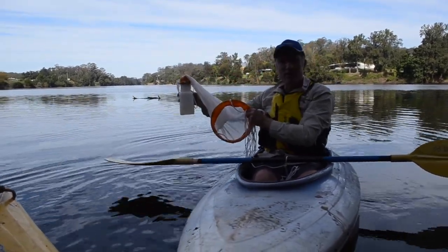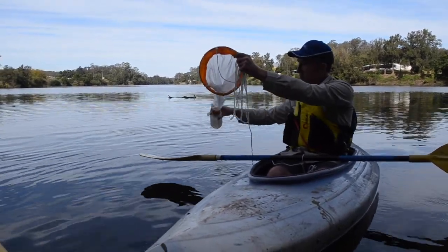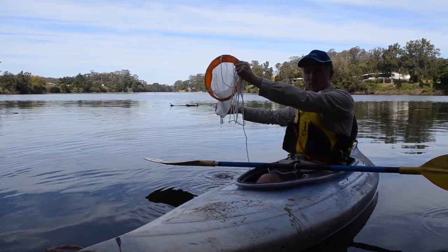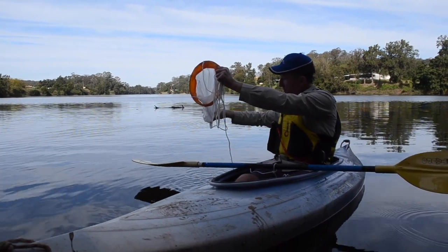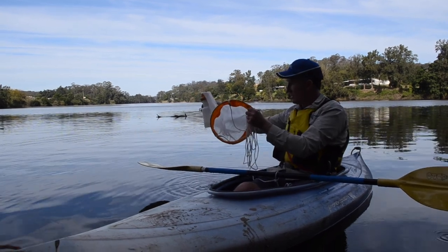Now we'll do that ten times. As the bottle gets full, you can concentrate the sample by just tipping some of the water through the net and putting it back in the bottle. It's a way of keeping the algae but tipping out the water and concentrating your sample.